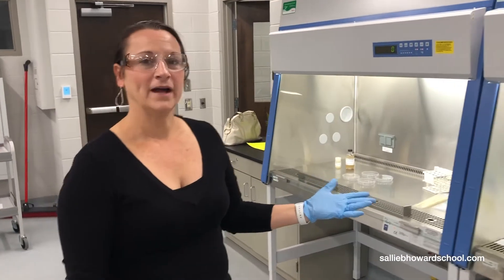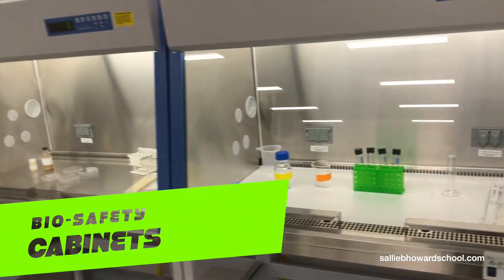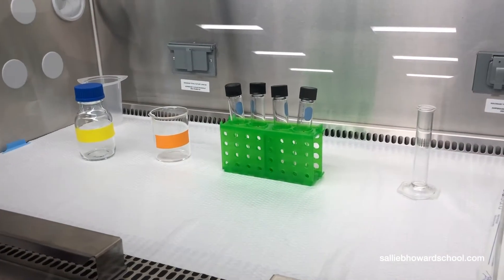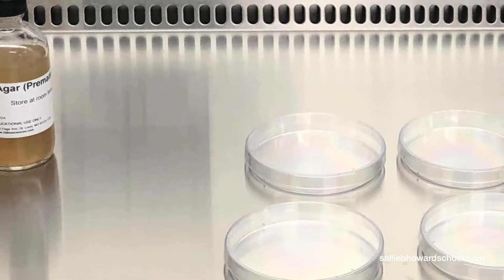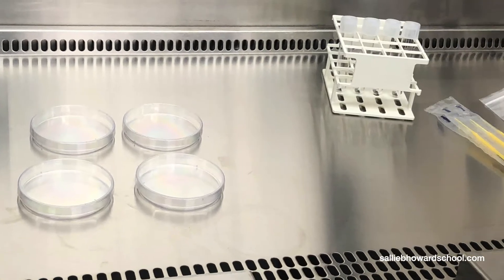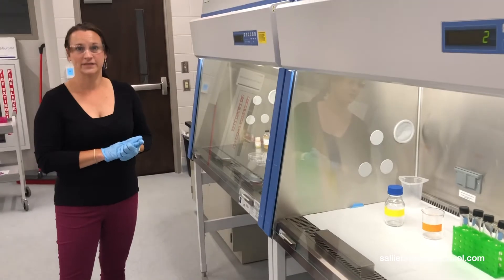Here we have our biosafety cabinets. This is where all students will do their sterile work. An important technique for biotechnologists is aseptic technique. Maybe we're doing cell culture and we're growing cells, and we really don't want to contaminate them. We would work in this hood, which has a sterile flow of air coming down. Everything in here is handled meticulously — we do not want to contaminate our cells.